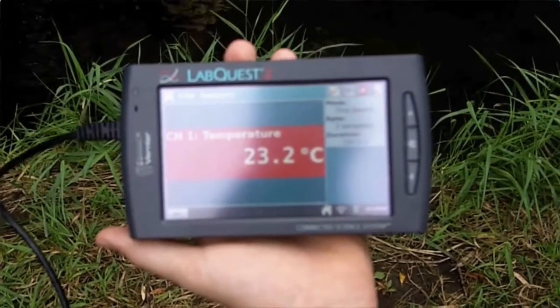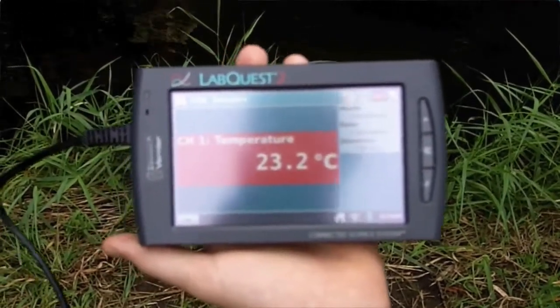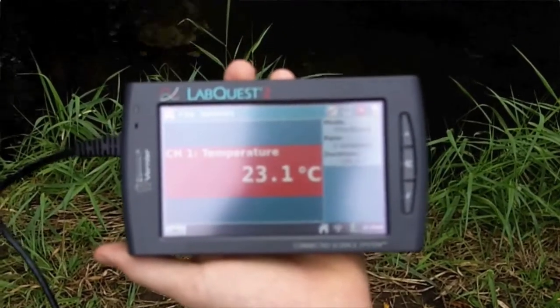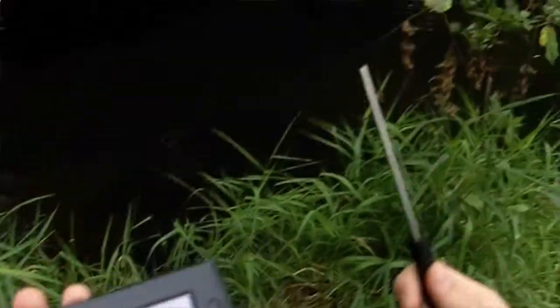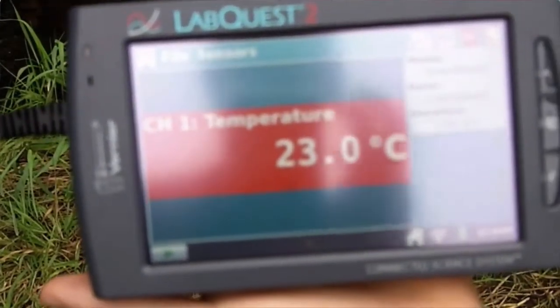So the next step is to actually use the LabQuest 2 in order to get some data measurements. First thing we're going to do is turn the LabQuest 2 on by pressing the power button, which is on the very top. Once you've got that turned on, you should be able to take your temperature probe, plug that into channel 1 on the side, and that should automatically bring up the screen that says temperature.